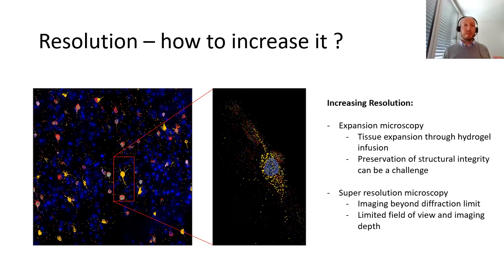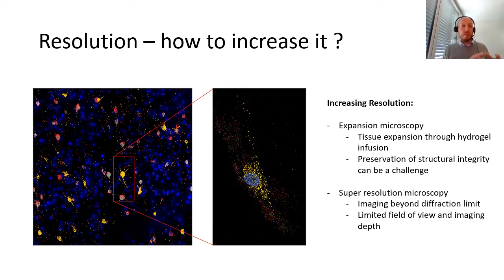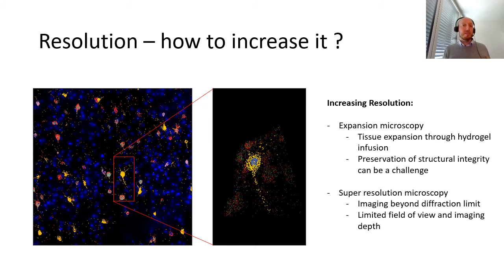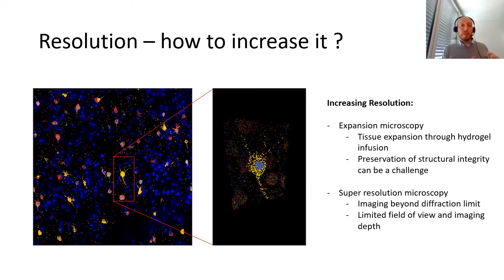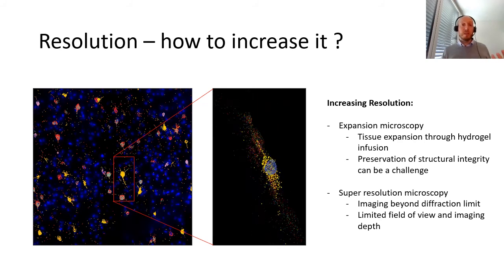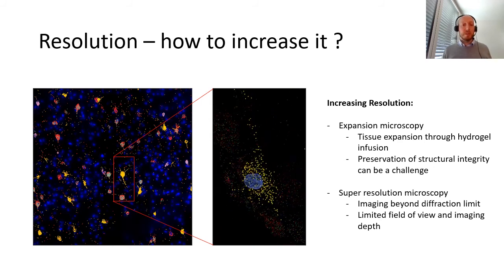First, the density of the transcripts within the cells. And here we are looking at 322 somatostatin transcripts at subcellular resolution. And I think from this, it is easily conceivable that if there are many more, molecular crowding of signals might become a problem, and individual transcripts can no longer be distinguished from one another. So this is something that we have to keep in mind.